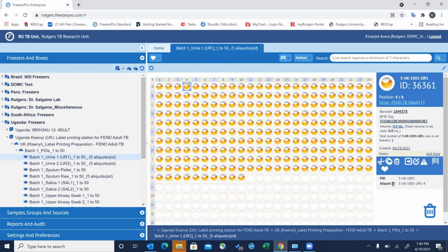I'm going to go over the contents of Freezer Pro, like the database and what information is included, later on in another video. Now I just want to focus strongly on how to print labels.